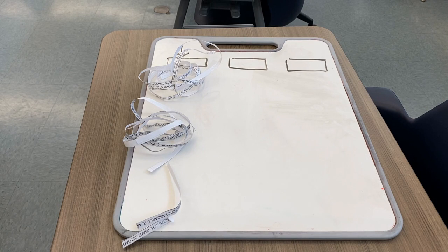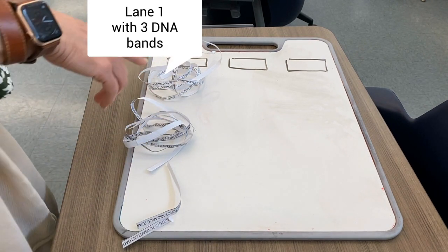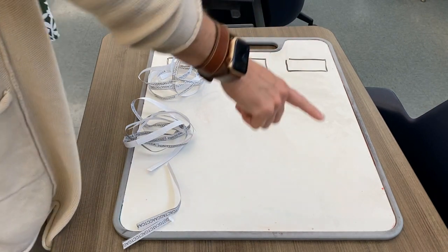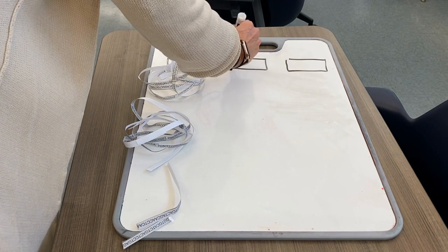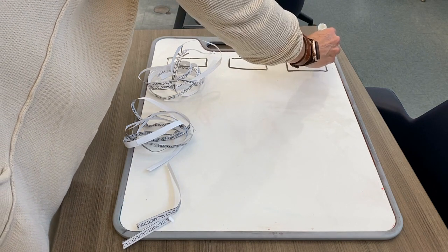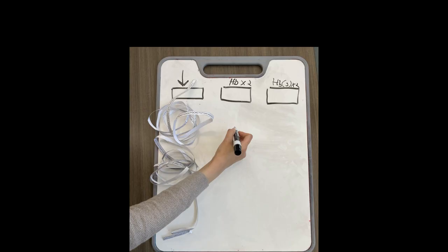This is now called a lane. This is lane one, well one, lane one. Your job will be to determine what lane 2 and 3 will look like. So, lane 2, you will load DNA that has two normal hemoglobin genes. So, that's hemoglobin normal times 2. That's homozygous. In lane 3, you will load DNA that is sickle cell. Both genes are sickle cell mutated, also homozygous.